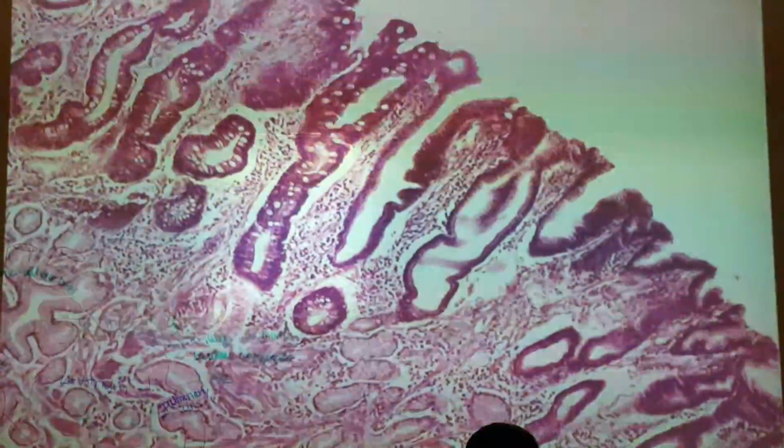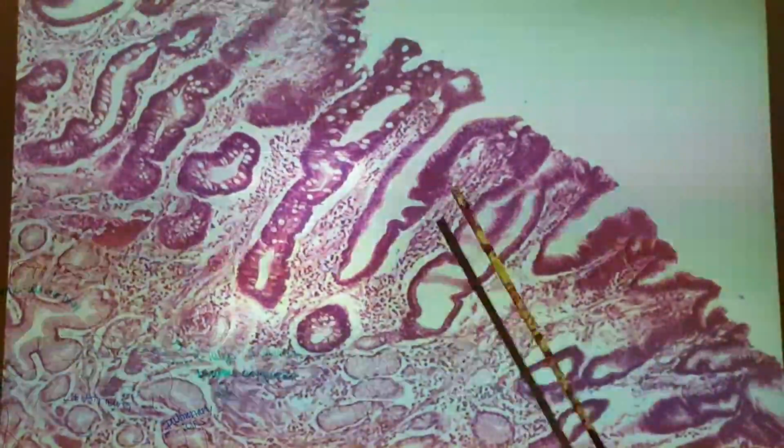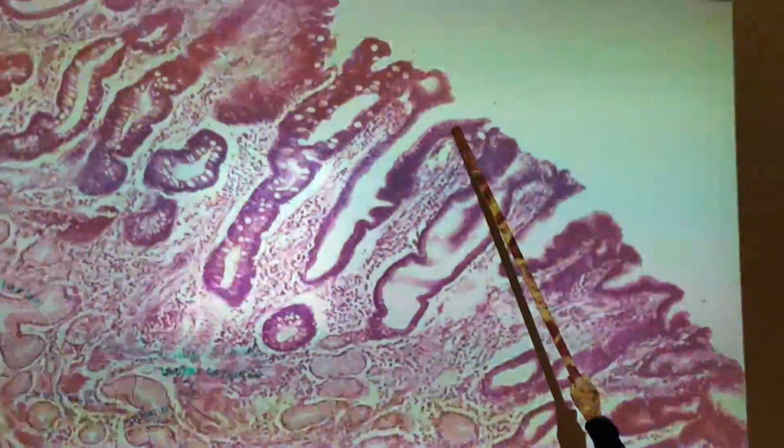And you can see them much better in this microscope. They're going to have a nucleus that is more toward the outside edge, so it gets a lot darker here simply because there's the dark nuclei, and you'll be able to see that better in your own microscope.